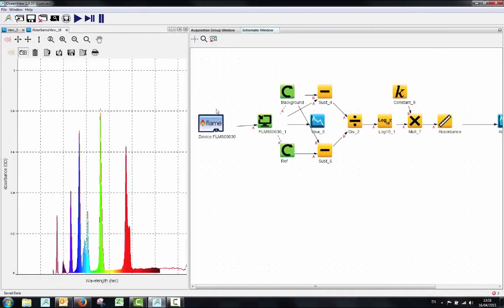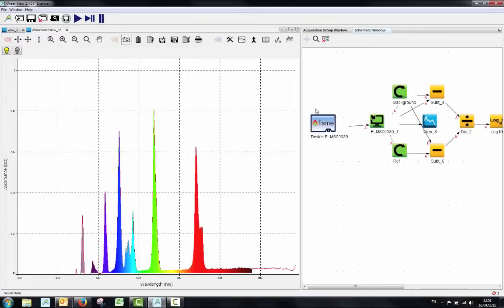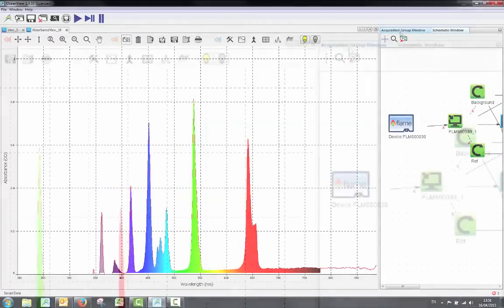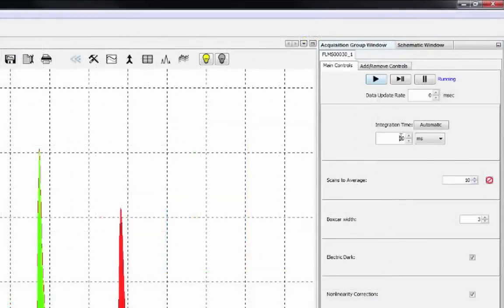If you want to change any of the acquisition parameters, make sure you take a new dark and reference using the bulb icons at the top of the screen.